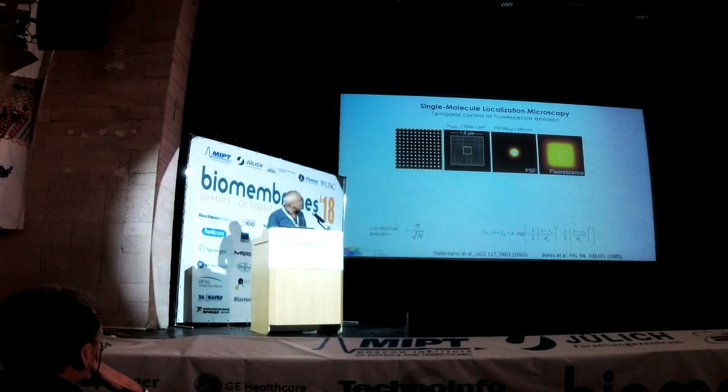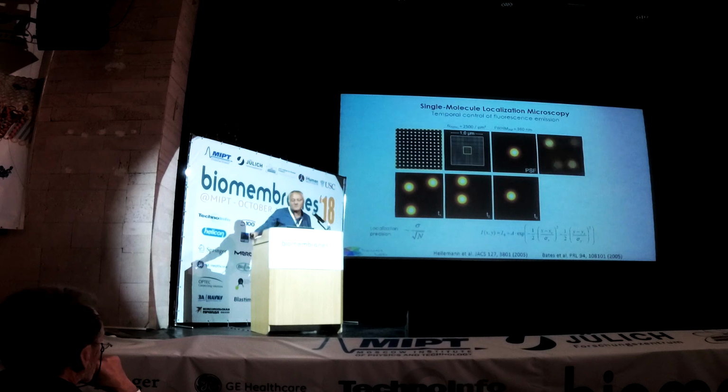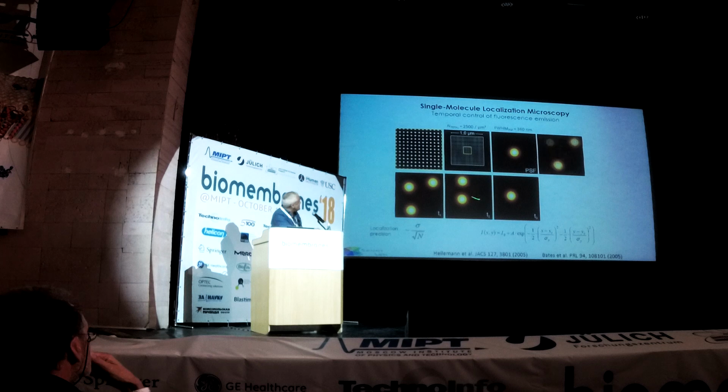However, now imagine that it would be possible to separate the fluorescence emission of these individual fluorophores in time in a way that ensures that out of these 2,500 fluorophores, only a few of them are allowed to emit fluorescence, let's say 2 or 3, at any time of the experiment, while 2,497 or 2,498 fluorophores stay in an off state. So that in each of these frames, while you record this video, there is only a sparse subset of 2 or 3 fluorophores in active state.